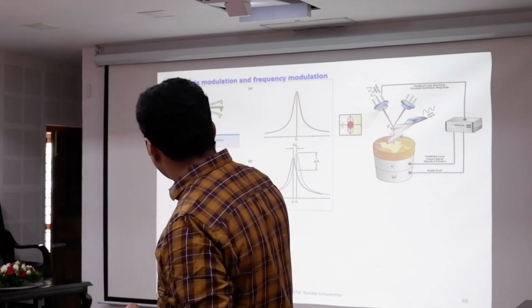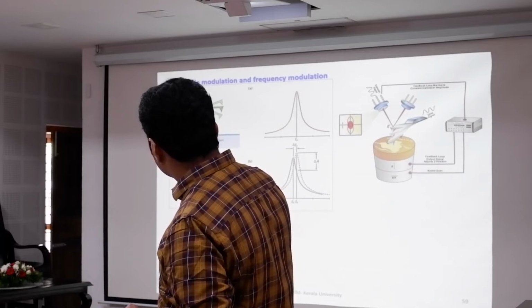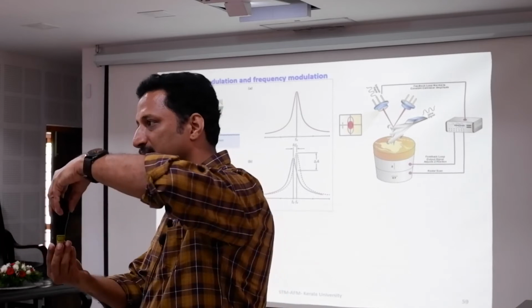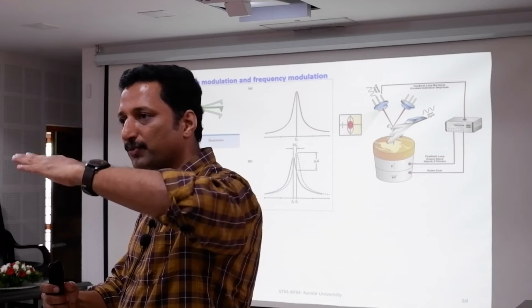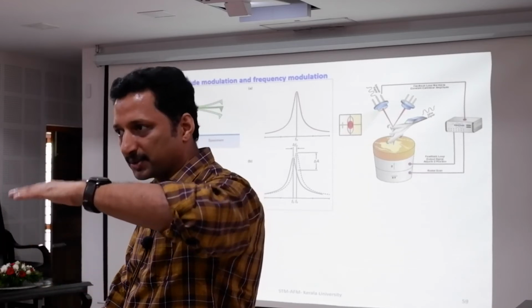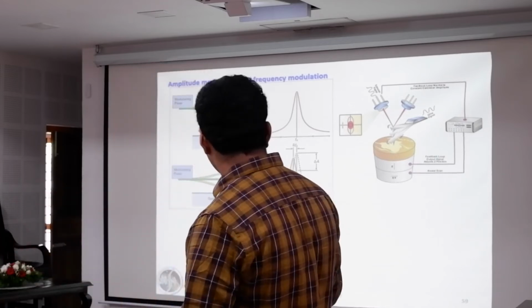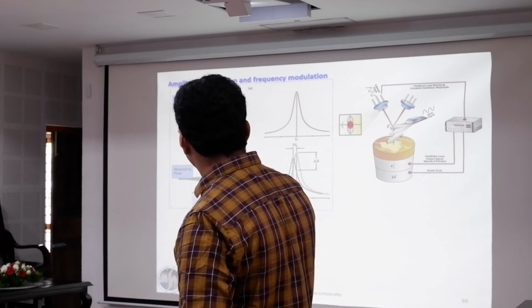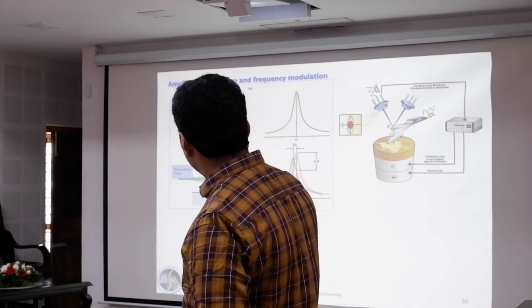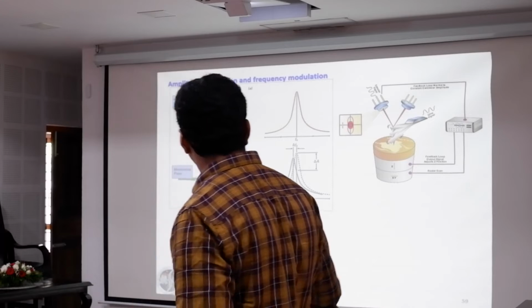Now, when the tip is vibrating and coming closer, it will shift a little bit, because there is an additional force here. Again, remember, a tuning fork which is vibrating, if you attach a rubber band to it, will be damped. The phase, amplitude, everything will change, and there is a slight change in the frequency also. So frequency shift, amplitude shift, all these things come at the same time from the same sample, so you will get three different ideas about that.